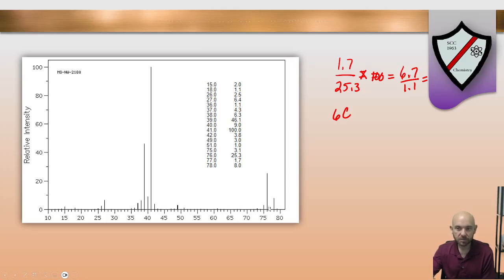My best guess would be to say there are 3 carbons on this molecule, which puts us at a base mass, if you will, of 36, and then you can add 35 for the halogen in there for a total of 71, and then you have room for 5 hydrogens. That probably means you have a double bond somewhere in your molecule, but that's just a guess.